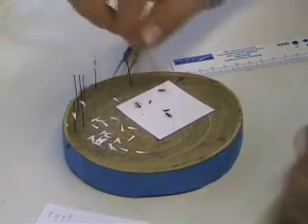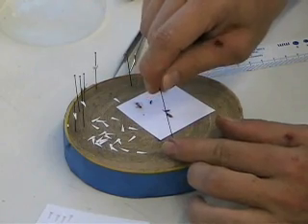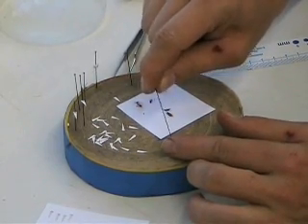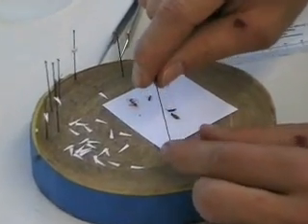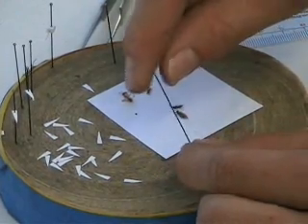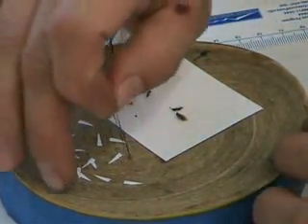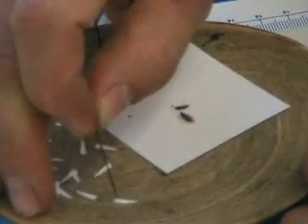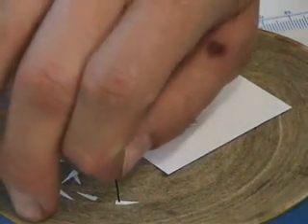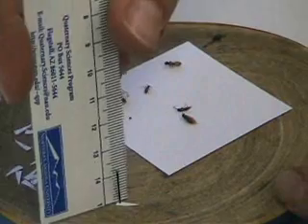To make a point, you use an insect pin, preferably a number 2 or number 3. It doesn't really matter how large the pin is because you're pinning it through the paper — you're not pinning the specimen. So preferably a large or thick pin is great for points. I take the pin and instead of pinning the insect, I'm putting the pin through the point, through the fat end of the triangle.